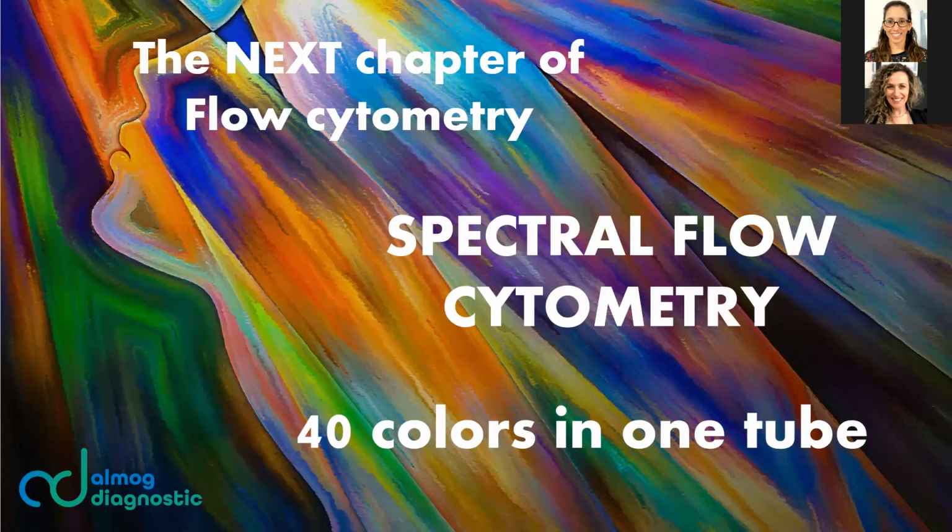Instead of one detector, one fluorochrome, the new technology enables full spectrum analysis, which gives a unique fingerprint to every fluorochrome. In this way, it is possible to get up to 40 colors in one tube and in combinations that you could not imagine in your wildest dreams.